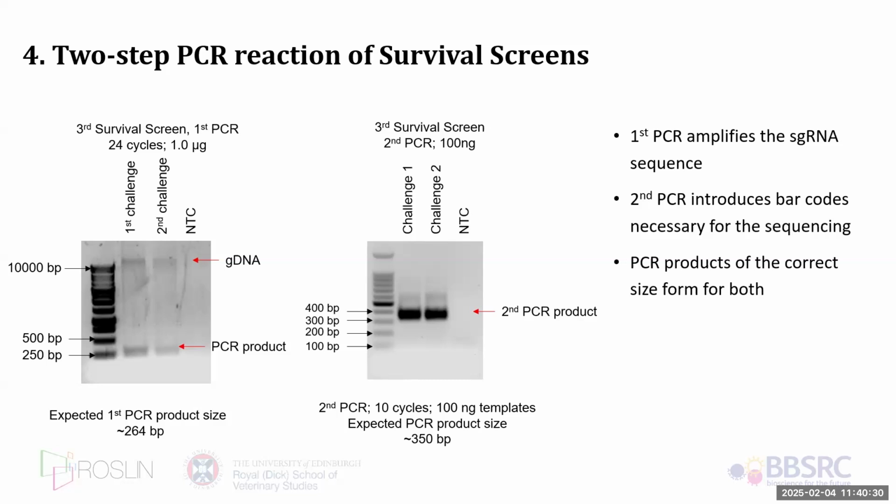And you can do this by initially taking some DNA that you've extracted from a sample and doing a PCR where you sample the PCR at 10 cycles, 15, 20, and then try and narrow it down. Kind of a key aspect of it, because if you get PCR skewing, then it throws off all your results.